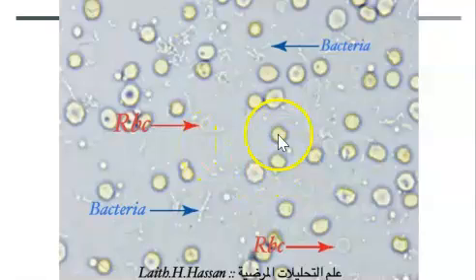All these others are also red blood cells on this slide. It's just that the ones that are brighter looking are closer in depth on the slide, and the ones that are not looking bright and shiny are farther away, deeper in the slide.